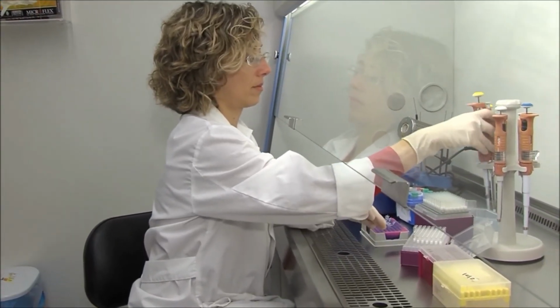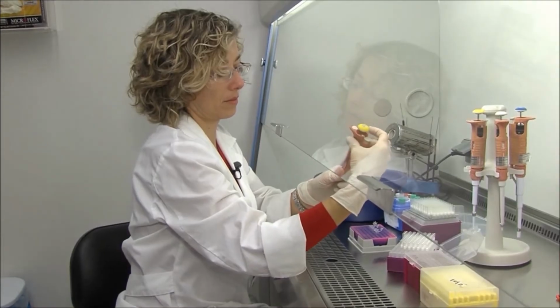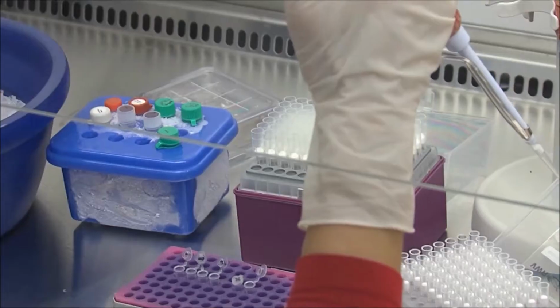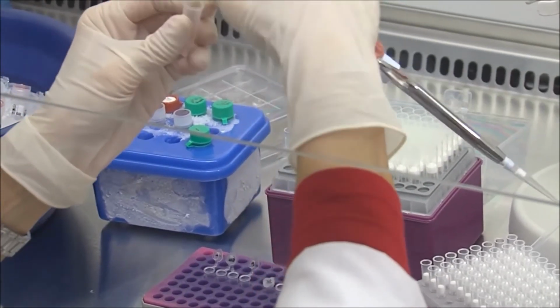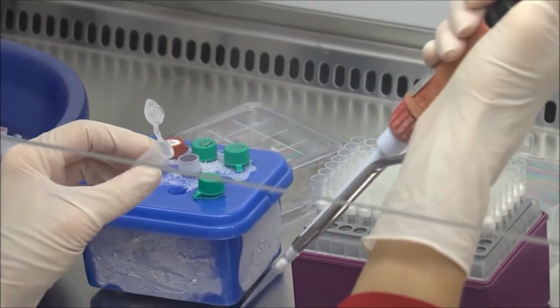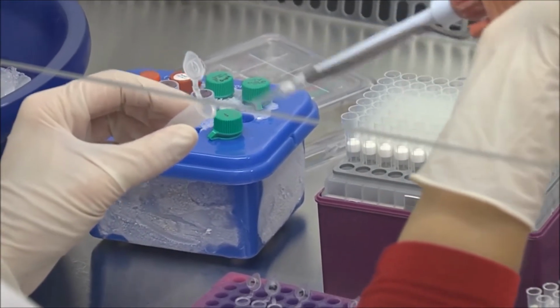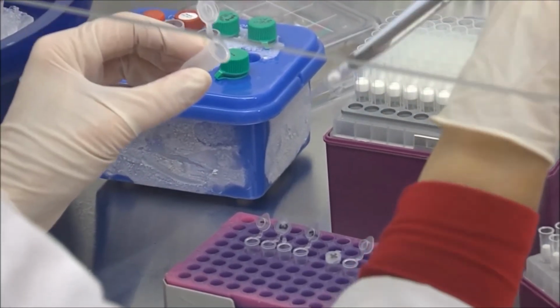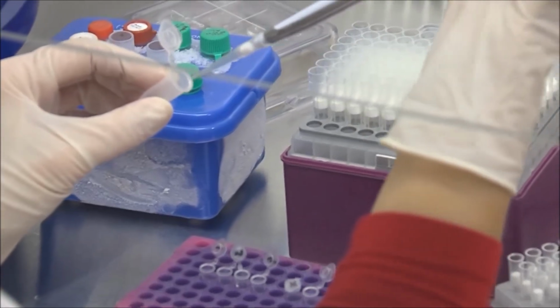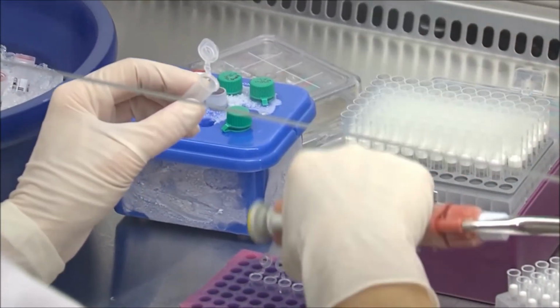Thì chúng ta sẽ chạy 4 mẫu xét nghiệm, một mẫu positive control, một mẫu negative control. Negative control thì chúng ta sẽ mở cái nắp của tuýp phản ứng đó trong suốt quá trình thao tác để chúng ta kiểm tra là có những template hay những chất gây dương tính giả có trong cái tủ thao tác hay là trên tay của chúng ta hay không. Thì hiện nay cô ấy đang aliquot từ master mix ra cho từng phản ứng một.